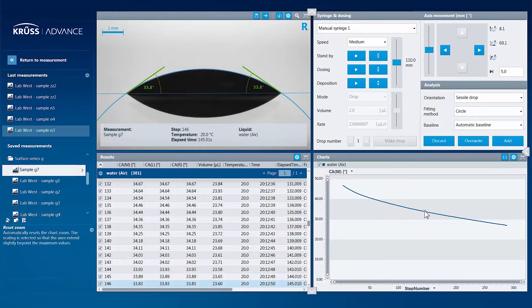Using these saved images, you can even change the parameters of a measurement and then re-analyze a single captured frame or the whole measurement sequence.